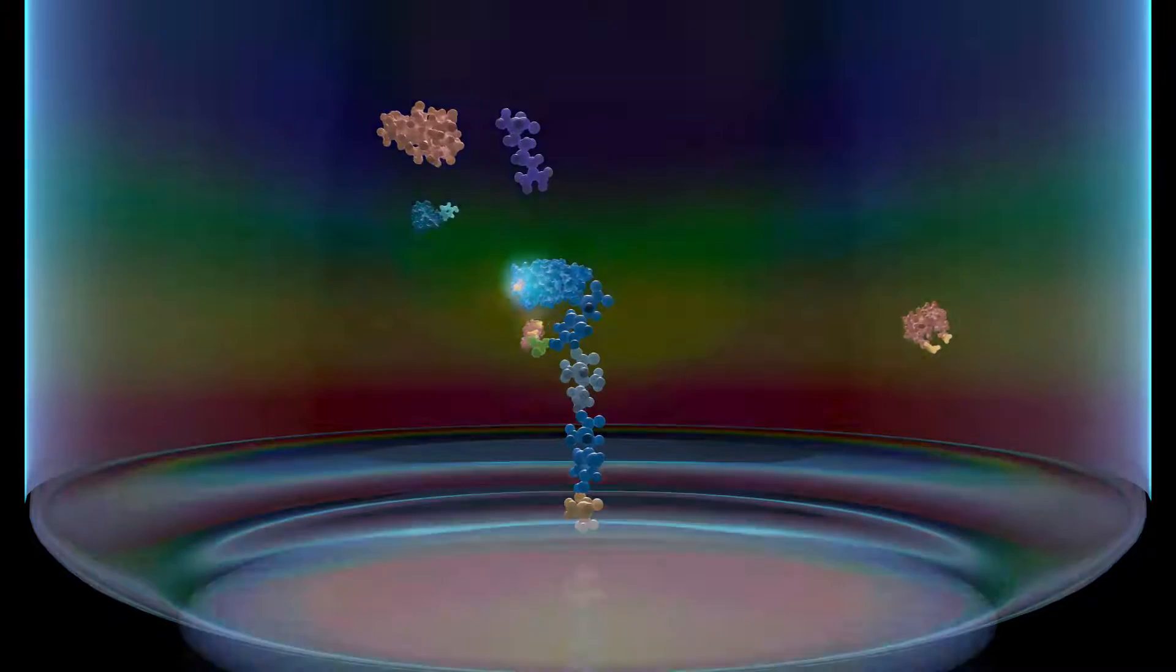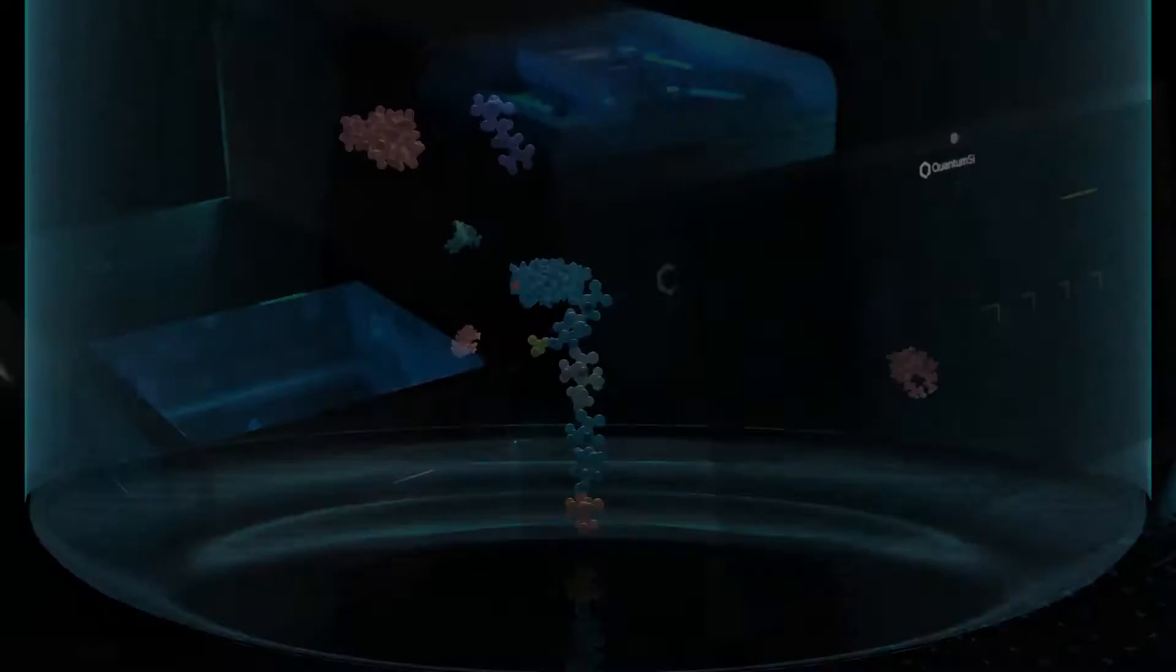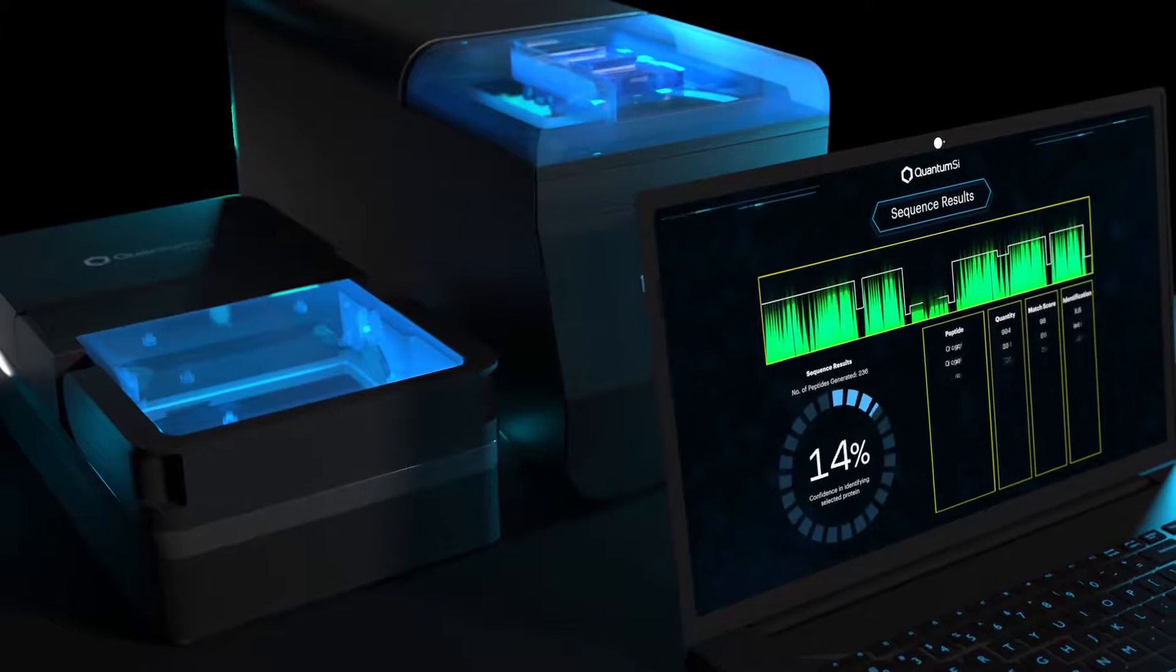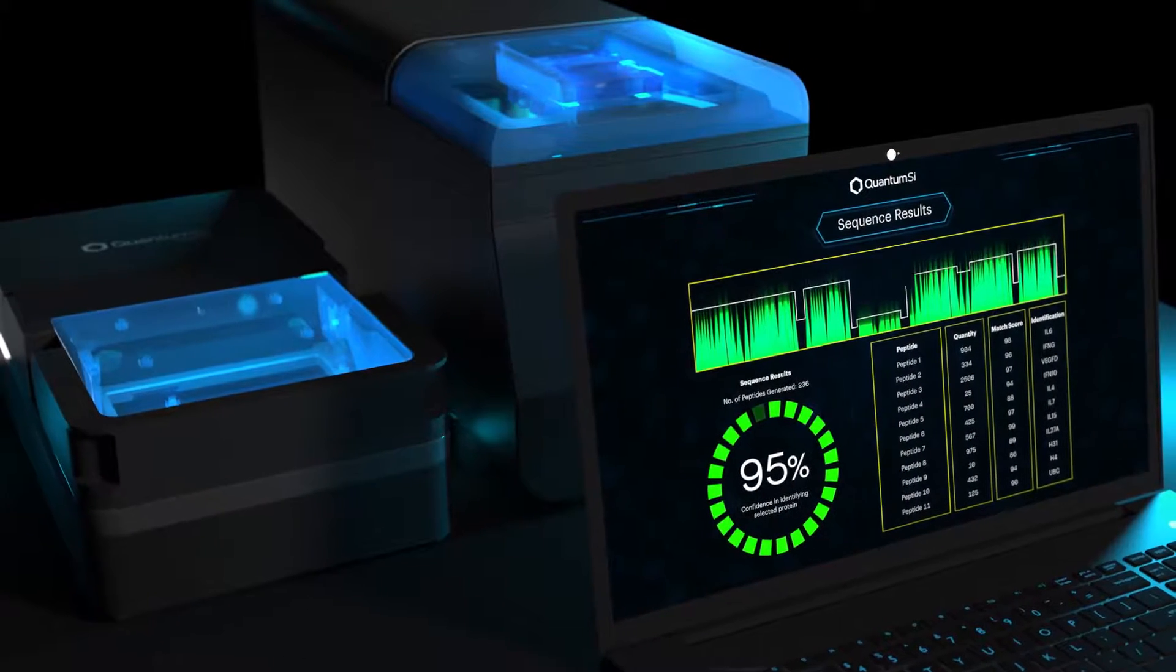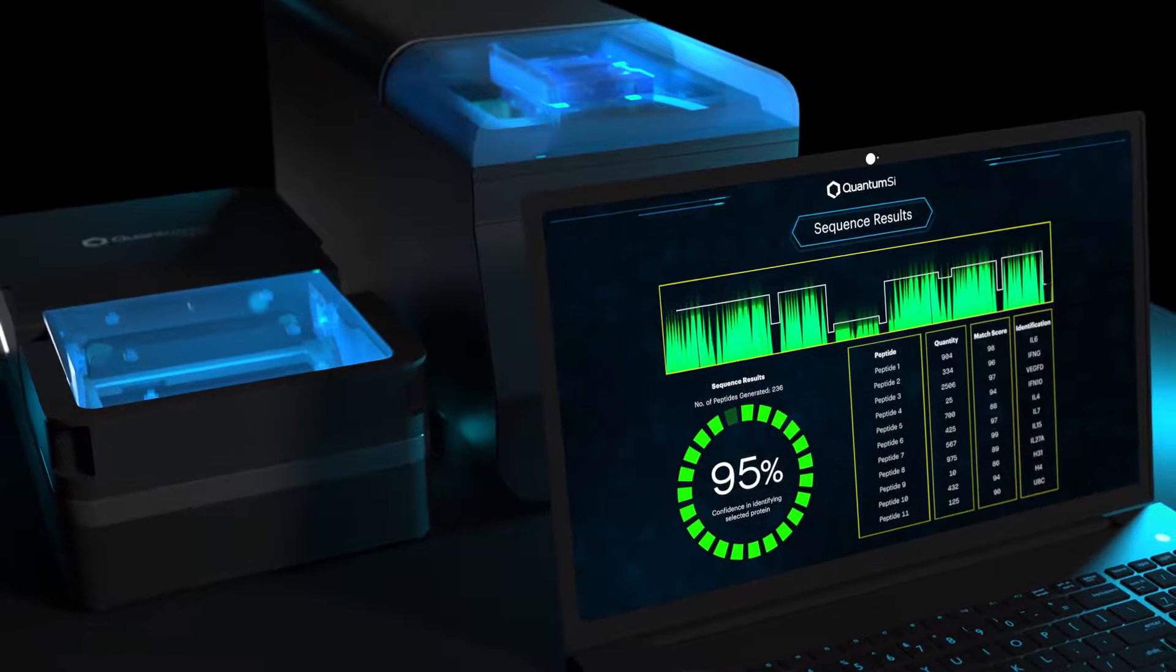A new recognizer binds and the process is repeated until amino acids in the peptide are sequenced to identify and quantify the original digested protein. This happens across millions of wells on a single chip in parallel.